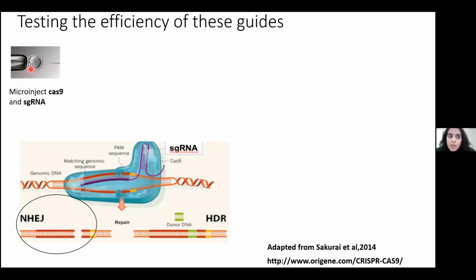So you don't inject a donor DNA. What happens is when the region is chewed up, you have a gap which is filled up with random insertions and deletions.